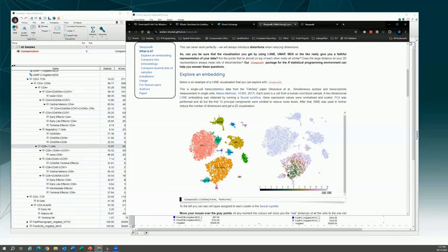So in this way, we can interrogate and move around our embeddings and get an idea of how well did it really embed my data? On the left, we have B cells, and I can see if I hover, this group looks pretty good. For this area where I'm hovering, in high dimensional space, these events are also closely related to one another. You can see out on the edges where there's the pinker, redder color, those are further away.